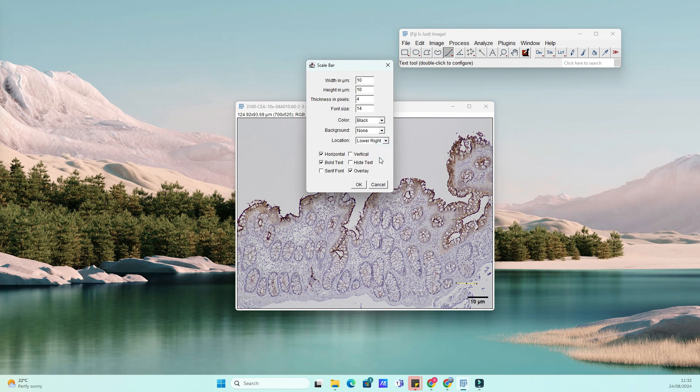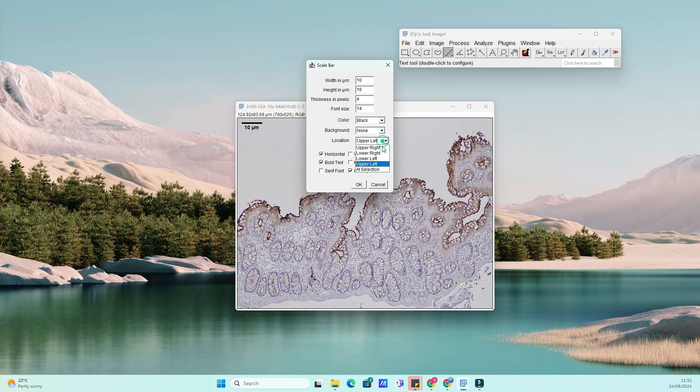If everything looks good, you can save your image by going to File, then Save As, and choose your preferred file format.